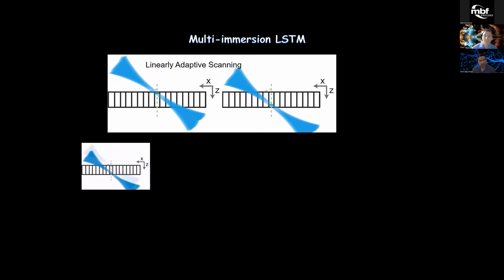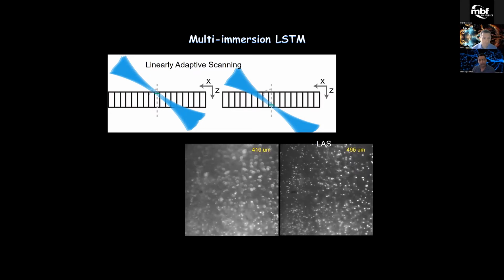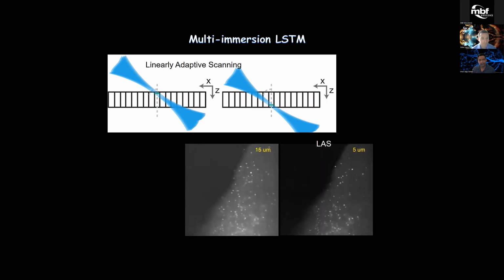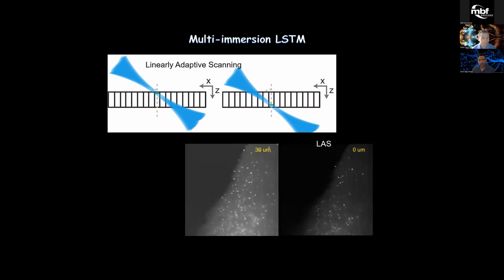So now, revisiting the same example, the right side is the same sample imaged with this LAS, linearly adaptive scanning, applied to the imaging. Okay, let's play it one more time. Oh, it refuses to play. Okay, all right, but you get the idea.